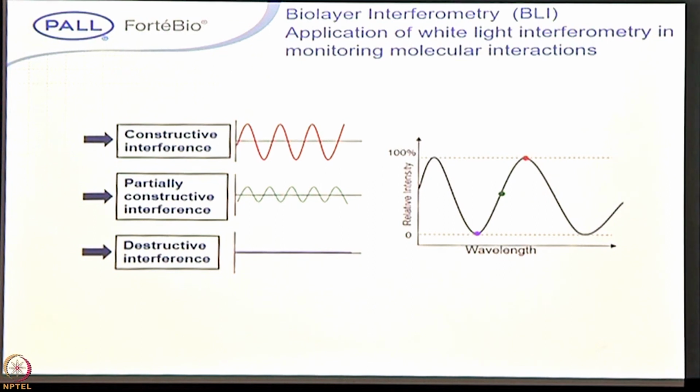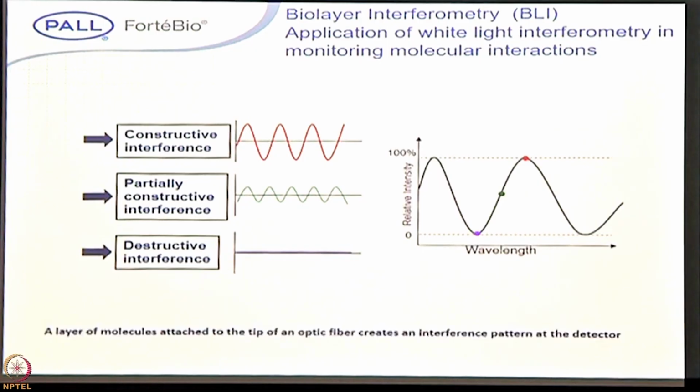So what happens? Where the waves with higher amplitude get superimposed, you can see the amplitude increased. Where they are partially superimposed, you can see this kind of pattern, and where there is destructive interference, the signal is completely cancelled.